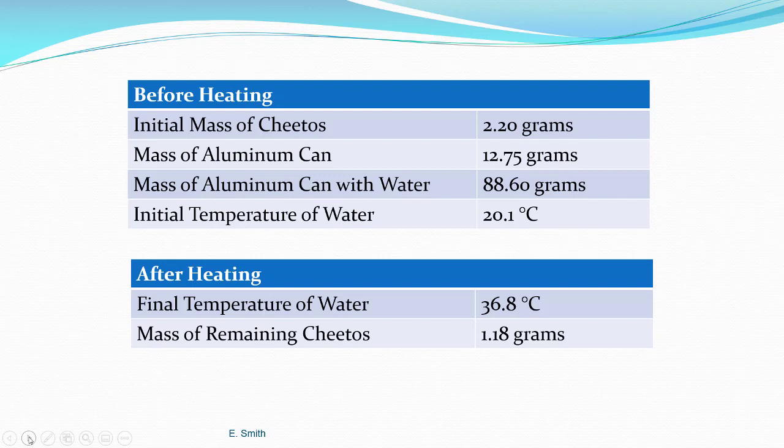First things first, you need to make sure that you open up your document. If you need to pause the video, go ahead and pause it and open up your document so that you have your calorimetry lab. What I'm going to be focusing on is analyzing the data that we collected.